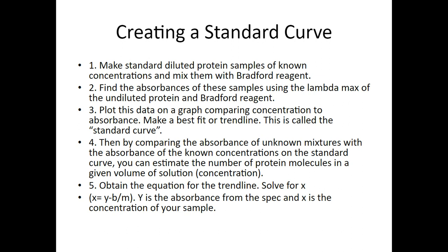So then, comparing the absorbance of unknown mixtures with the absorbance of the known concentrations on the standard curve, you can estimate the number of protein molecules in a given volume of solution. So then you have the equation. It's going to be y equals mx plus b as you see it in the slideshow program, whether it's Google spreadsheet or Excel.